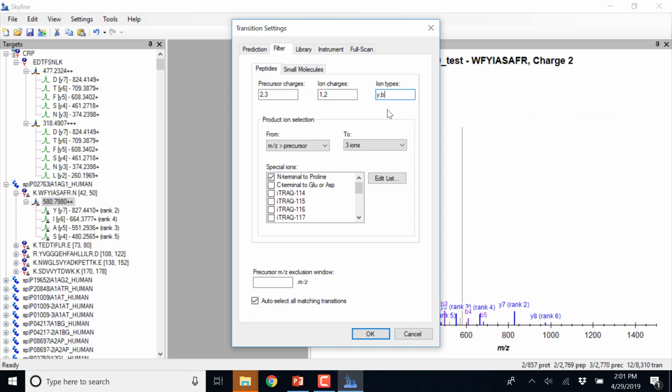I often do that when I'm loading the high-res accurate mass spectral libraries in so that I can go and see, is there really a peak for that particular peptide, or is it just kind of, it fell through the cracks and it looks like it's a good peptide, but in actuality it's not, because that happens too.